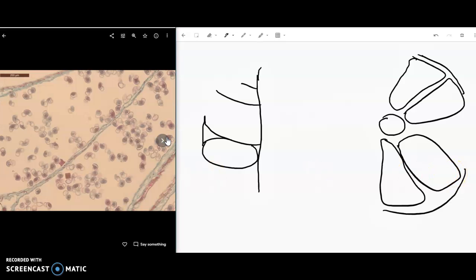And if you look really closely, we can even tell apart that blue layer of tissue, which is the sporangia itself, and then inside you'll see pollen grains. And at this point, most of these slides have the mature pollen grain. So you'll see those air bladders, and sometimes you'll be able to see the two nuclei, the tube and the generative. Sometimes you will not.